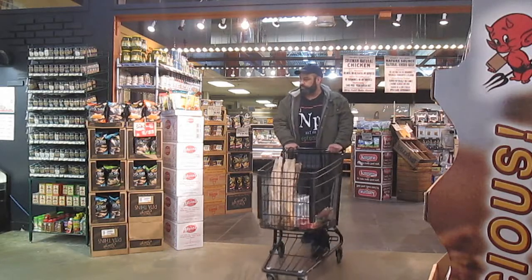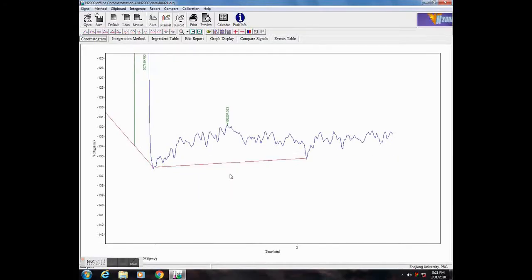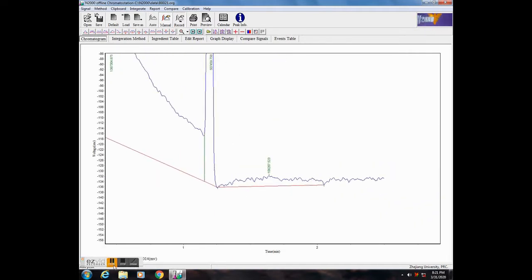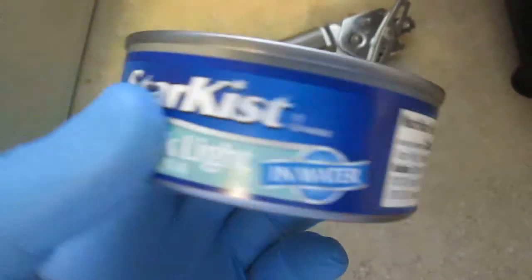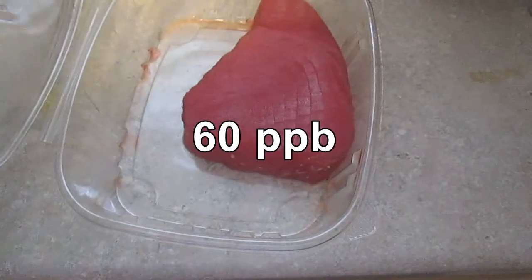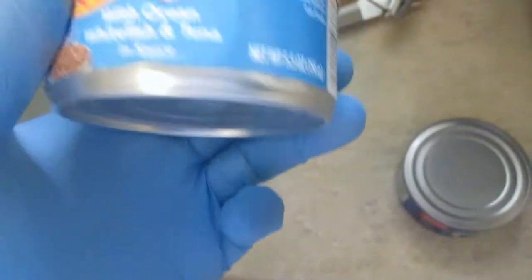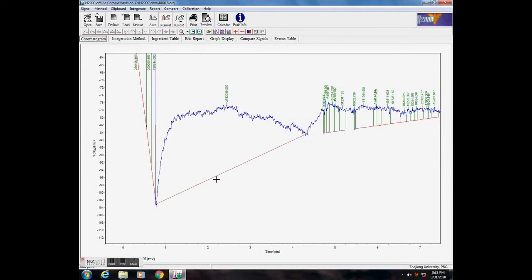So I went out shopping for some fish and here are my results. My blank came out at 50 ppb, and because my calibration is not reliable below about 50 ppb it's difficult to make sense of the following results. The tuna in a can was measured just above that at about 70 ppb, and the tuna steak was just below at 60 ppb. The swordfish gave a higher reading at about 150 ppb. To top it off, the cat food came in at 2,240 ppb — or 2.2 ppm — which is really alarming.